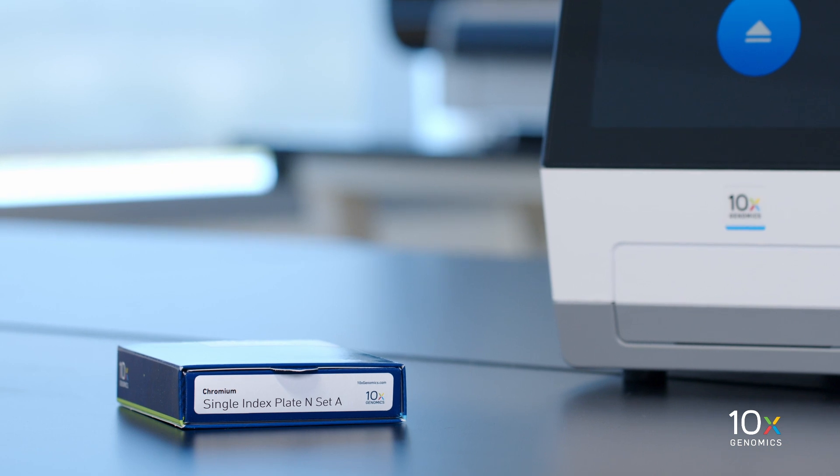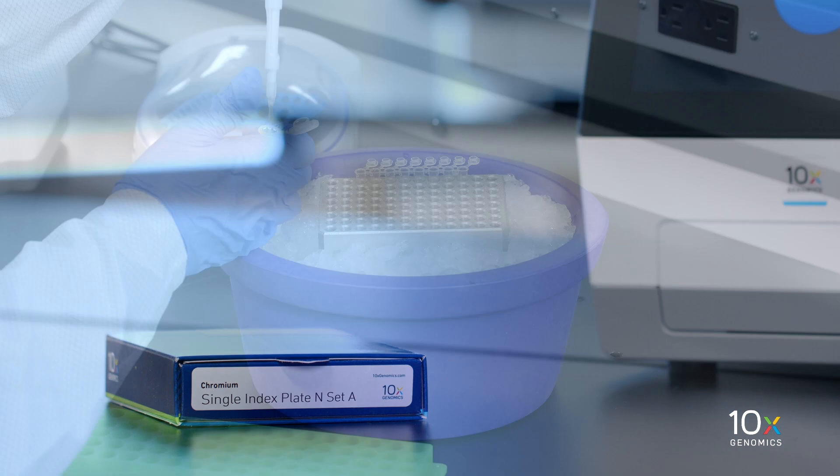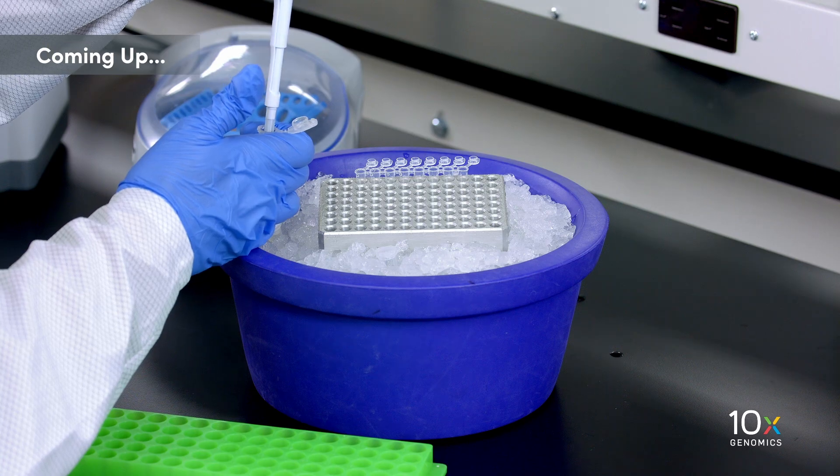Finally, we have our Single Index Plate N Set A, which is stored at minus 20 degrees Celsius. We have all of our Next GEM Single Cell ATAC reagent kits ready. Next, we will proceed to the transposition step.